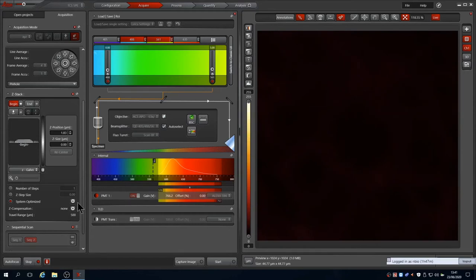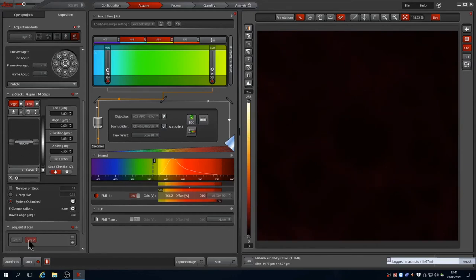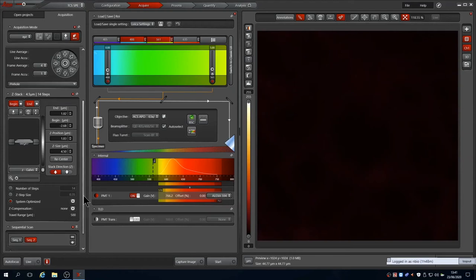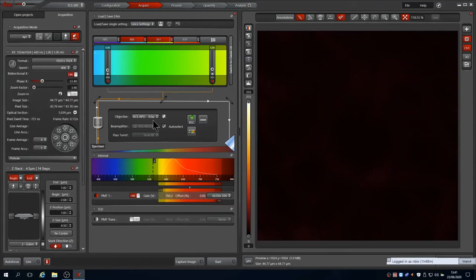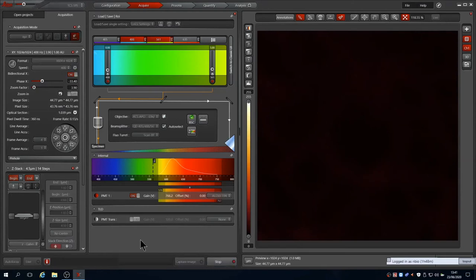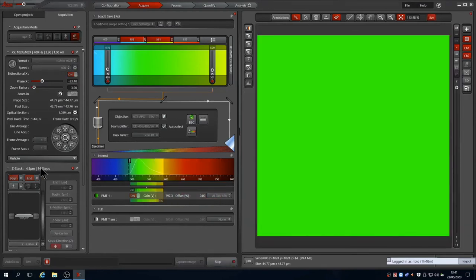Sometimes the range indicator LUT makes this easier to allow you to see the dimmer signal. The stack size is shown at the top. Left on system optimised, which we recommend, it calculates an overlap between the planes based on the optical settings, which are principally the NA pinhole and wavelengths. In this case it gives us 14 slices to cover 4.5 micrometres. Now pressing start captures both channels at each Z slice sequentially.